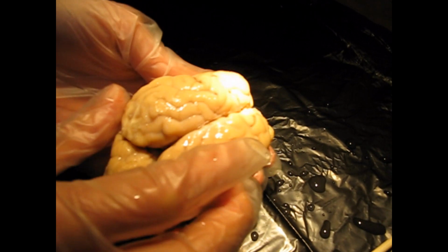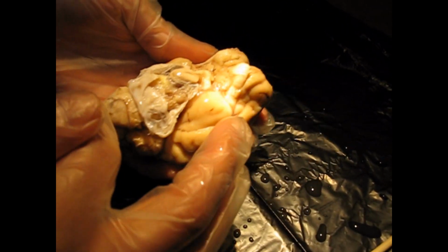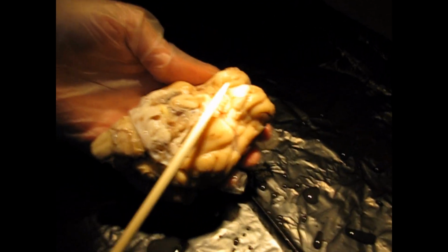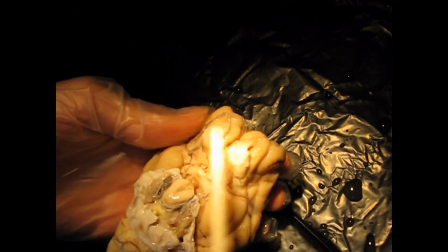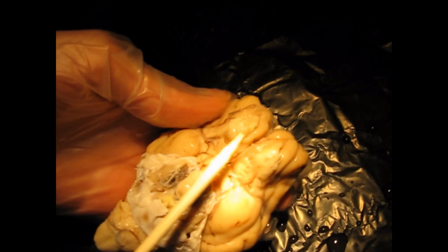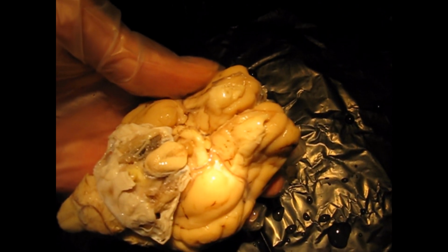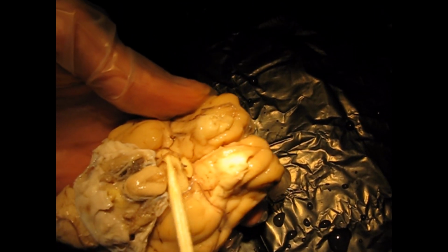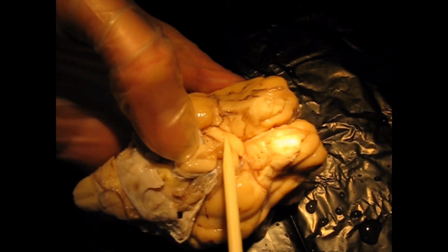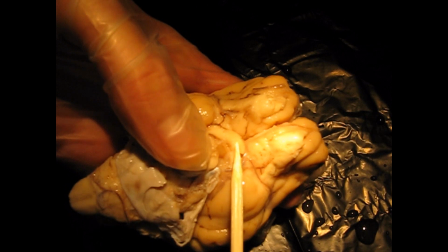Here. Alright, so we'll go ahead and look at the brain ventrally. Again, anterior, posterior, so the ventral aspect. Here's cranial nerve 1, or your olfactory nerve. These are the bulbs. They sit in the crista galli. Or sorry, they would be separated by the crista galli, which would be right here, and they sit in the cribriform plates. Okay, if you move a little bit more posteriorly, you'll see this structure right here. Okay, that's part of your second cranial nerve, which is your optic nerve.